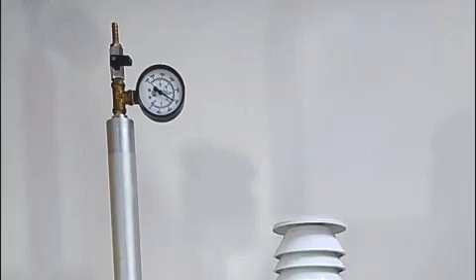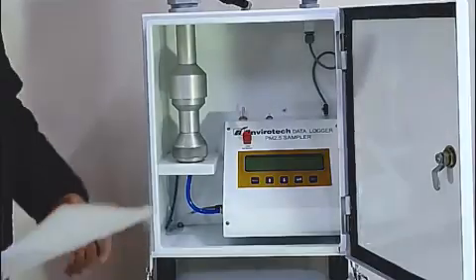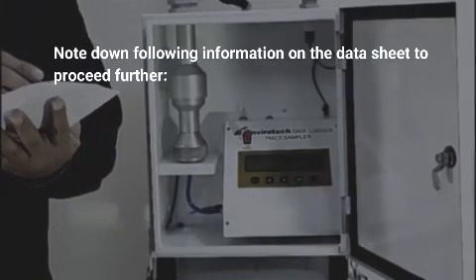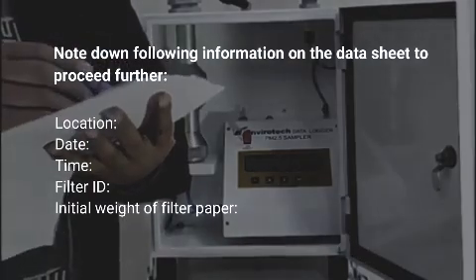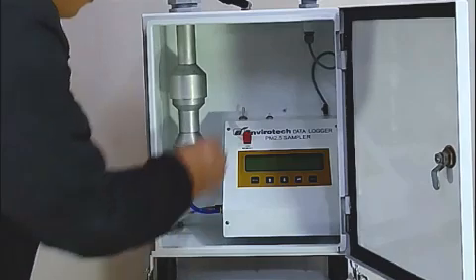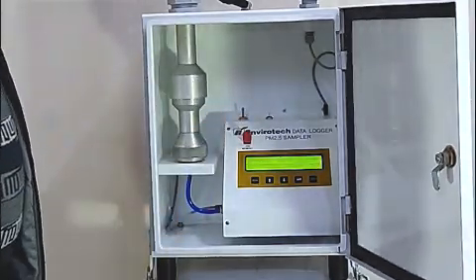After finishing the leak check test, release the pressure slowly by opening the adapter valve. Also open the leak check valve at the pump. Now, the instrument is ready for sampling, and note down the following information on the data sheet to proceed further. Location, date, time, filter ID, initial weight of filter paper, and switch on the instrument with the help of toggle switch on the data logger.